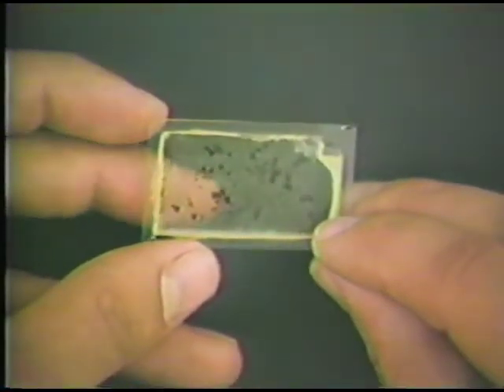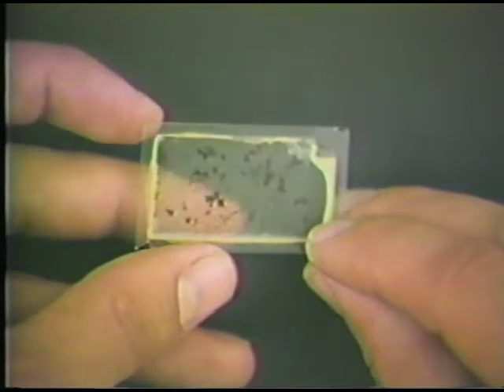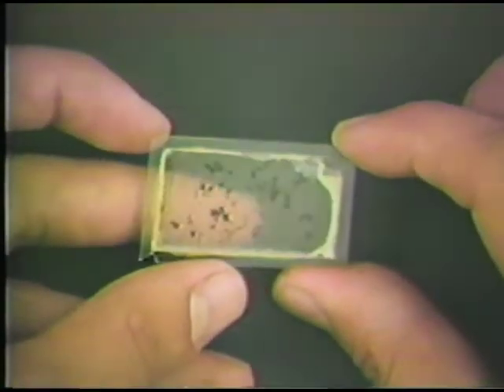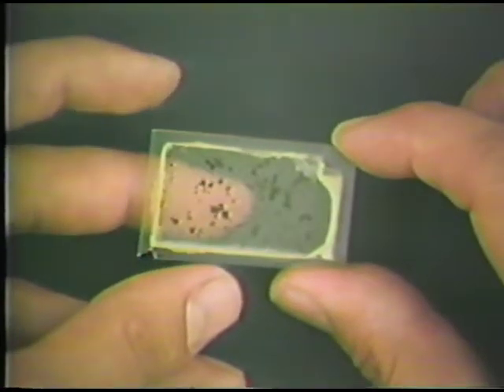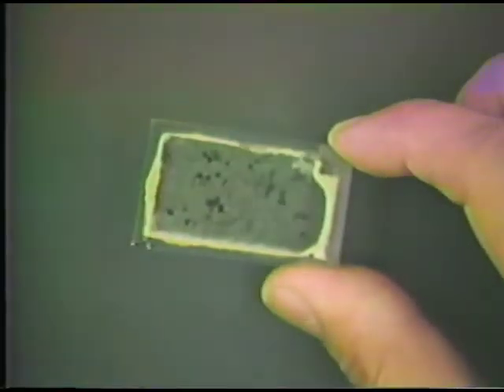Some of the minerals are a little bit more colored than others, but you can see right through. So the rock has been ground so thin that it's effectively transparent. So we're using transmitted light in the petrographic microscope, and we can actually see through the minerals in this rock.